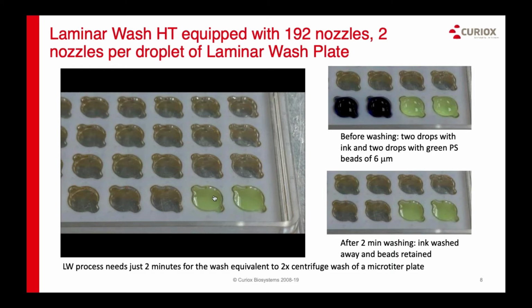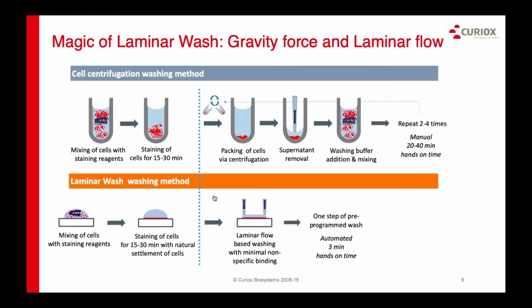Now, you may wonder how come the dye was washed away while the beads were retained. And just to clarify, the beads are not attached to the plate by any interactions, just as cells aren't attached to the plate by any interactions. They're simply resting on the plate and held there by gravity without any adhesion. And I'll show you in the next slide how this works.